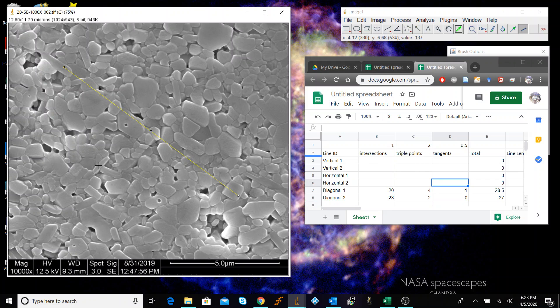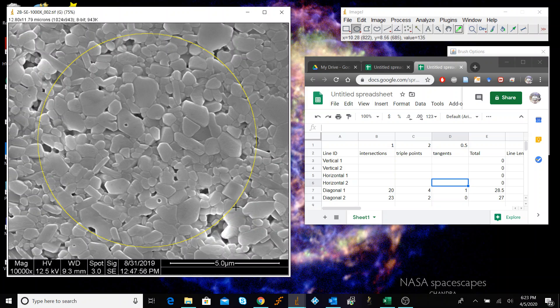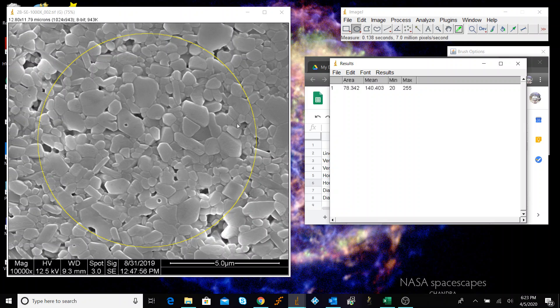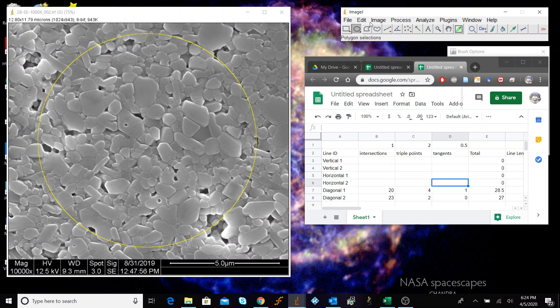That is the whole essence of the method: counting intersections, triple points, and tangents, adding them up using the equations in ASTM standard E112, or your lab handout, to perform your calculations. This can also be done with a circle — we can draw a circle of known diameter, do Control+Measure to get the area, and back-calculate the radius and circumference from there.